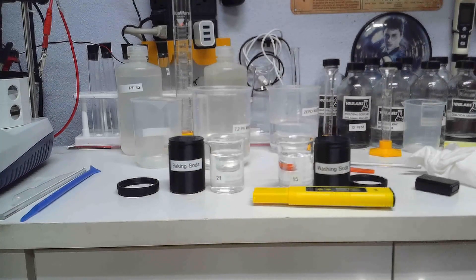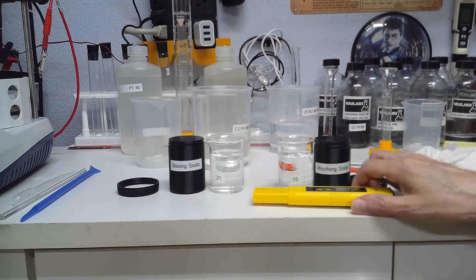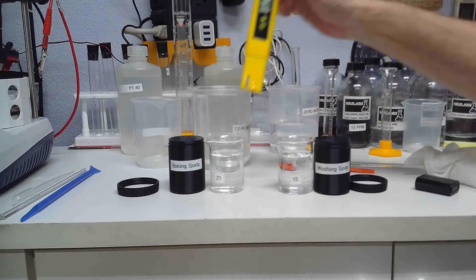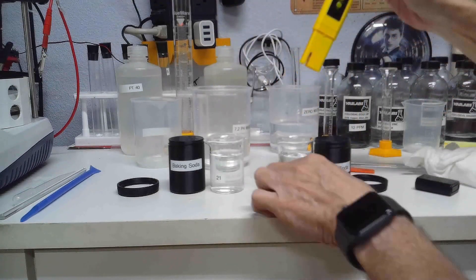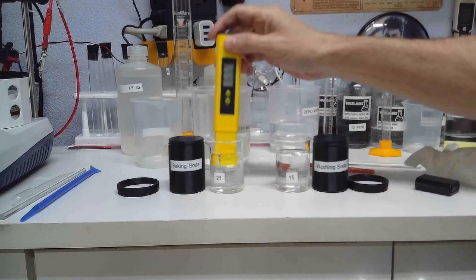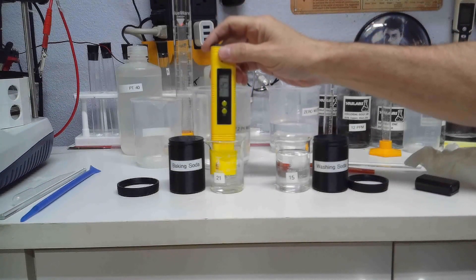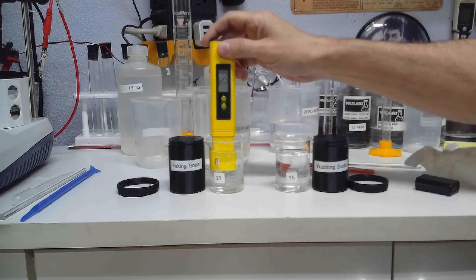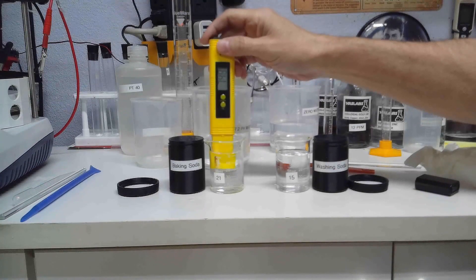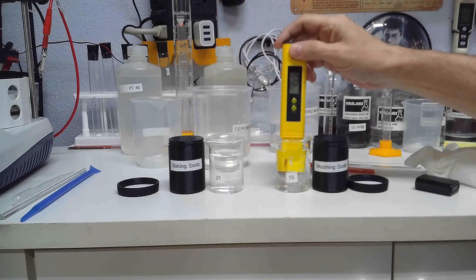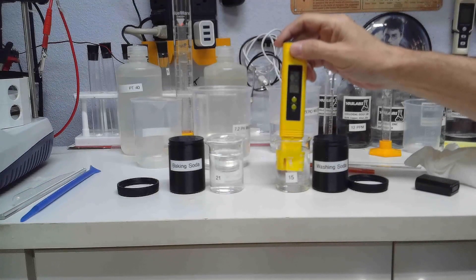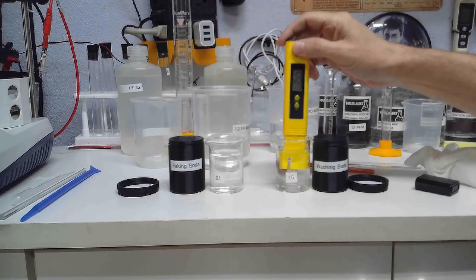So what's the difference between baking soda and washing soda? The difference is the pH. I have two beakers here filled with 50 milliliters of distilled water and as you can see the pH is around 7.5, 7.4 actually. Should be a little lower than that but I'm reusing these beakers.